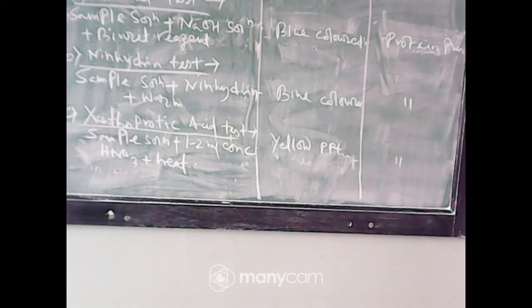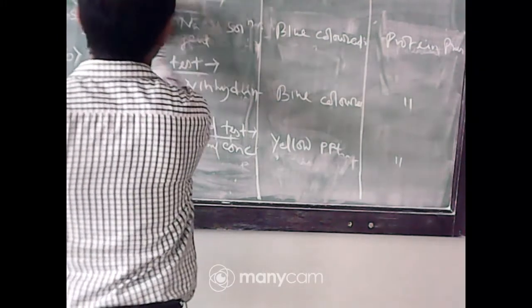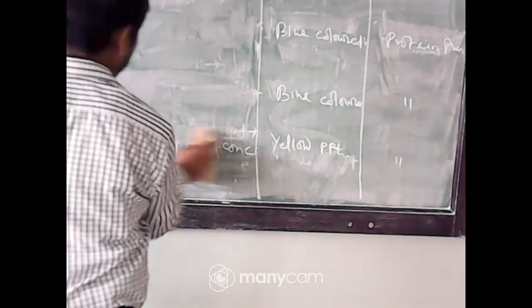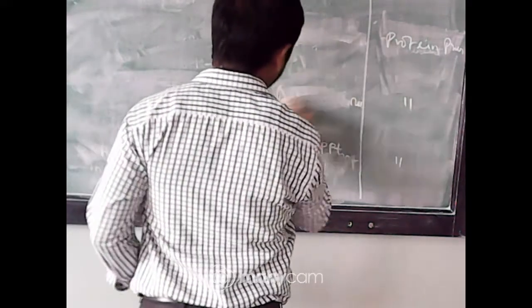Now I will go for the test for fats or oils. After that I have to perform the test and you will be the observer.